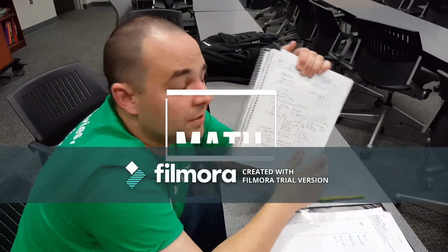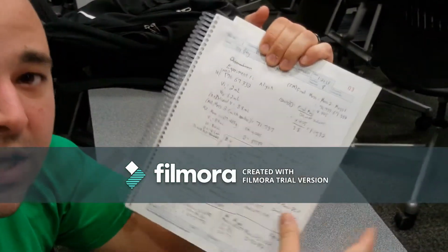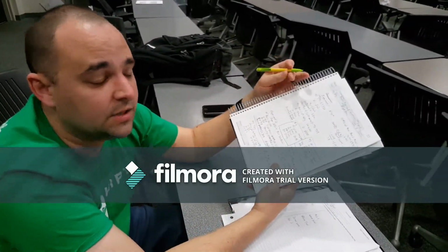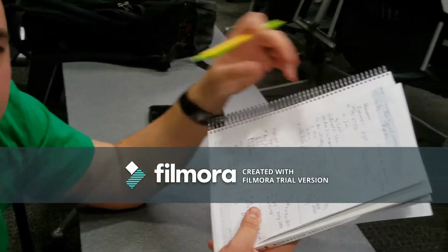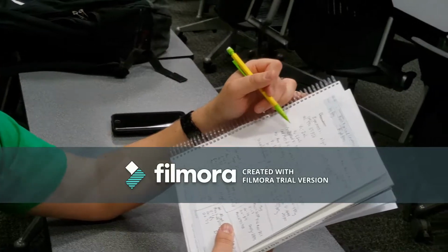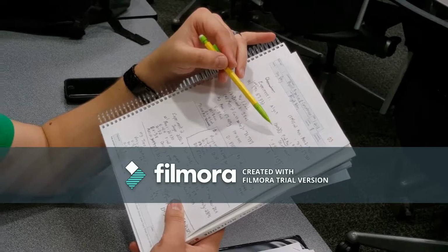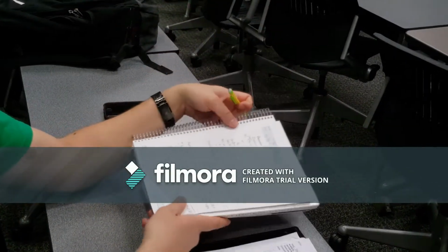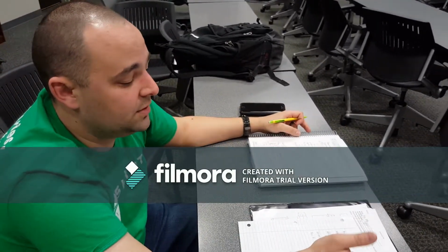Okay, so on the experiment we showed you earlier, we took a lot of numbers and did a lot of calculations. And now I'm going to walk you through how we got these numbers and calculations. Some of these were just measured values, either what the scale said or what the pipette said, which we're going to show you in detail. But some of these, like the delivered volume, the final mass, and the density, we had to do some calculations on. And then afterwards, we're going to show you how we figured out the concentration of an unknown. So let's get started on the numbers and what the math equals.